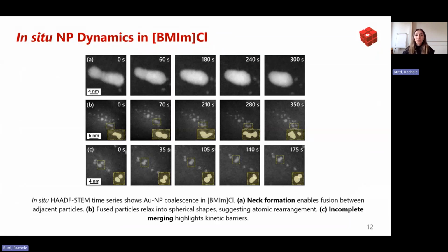Moreover, here there is more nanoparticle dynamics in the same imidazolium-based ionic liquid. This is a HAADF STEM time series, and in the top part of the figure, we have a classical neck formation which enables the fusion between particles in high proximity, whereas in the other example we have relaxation into spherical and less kinetically hindered particles, which suggests also atomic rearrangement.